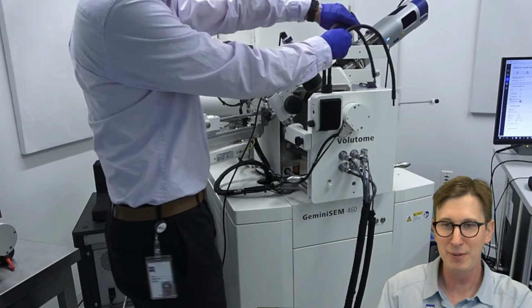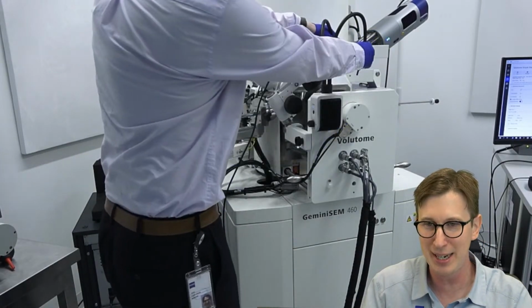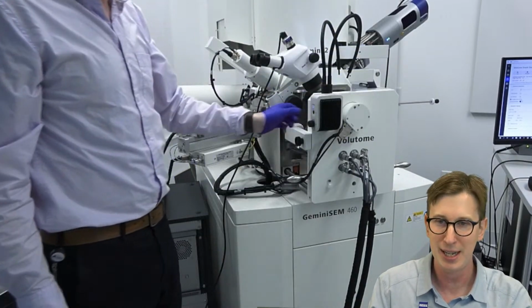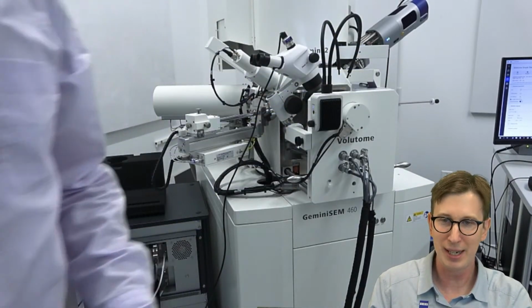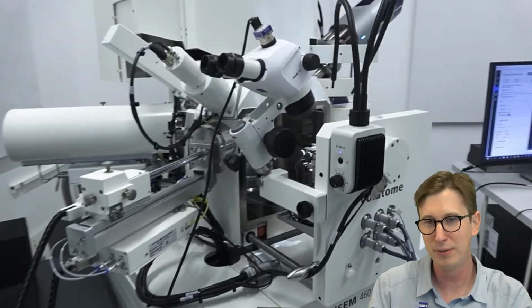Of course, we have some gooseneck lights that are integrated into the front of the door there, and I could turn that on, giving me the illumination I'll need. Now I'll move the camera closer, and we could get our first view of the actual Volutome stage.